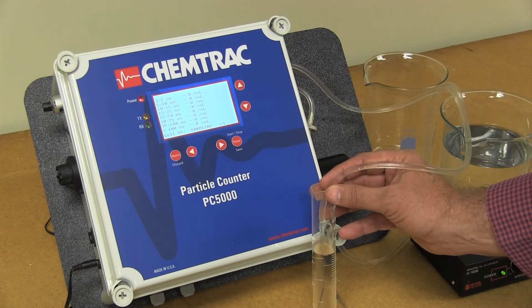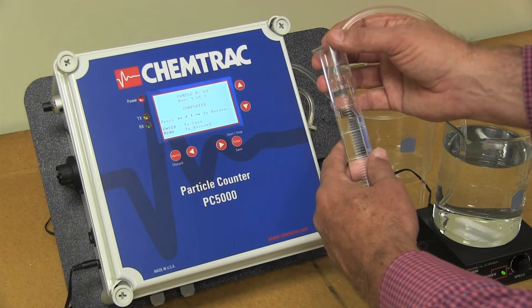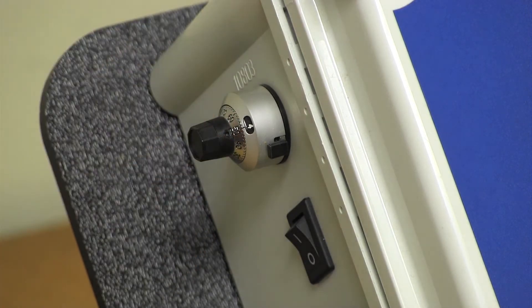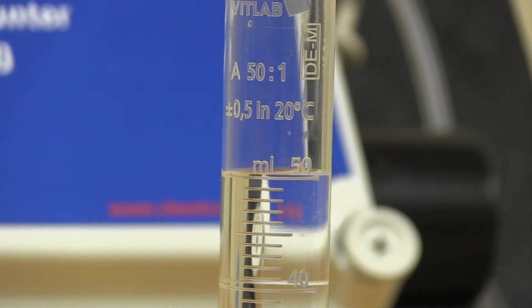The graduated cylinder should collect a combined volume of 50 mL. If the volume is more or less than expected, the pump can be adjusted with the knob on the side of the unit. Repeating the process allows for additional adjustments until reaching the expected volume.